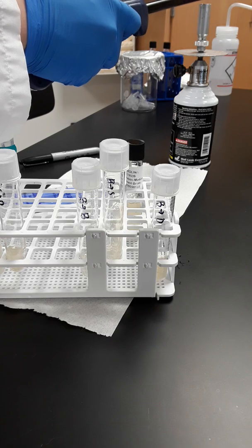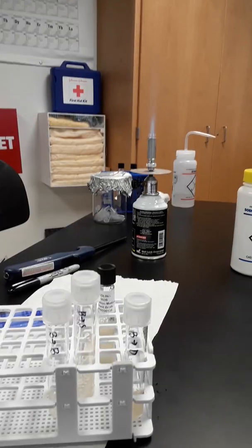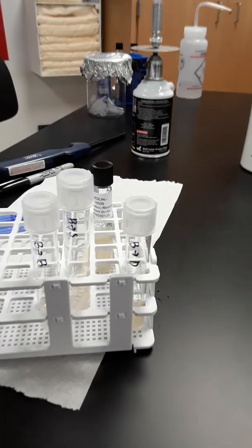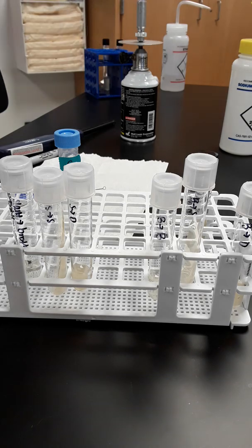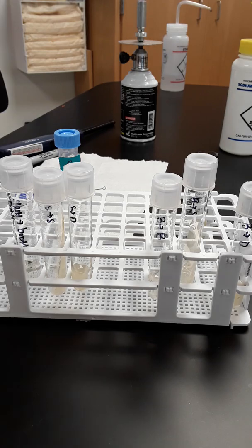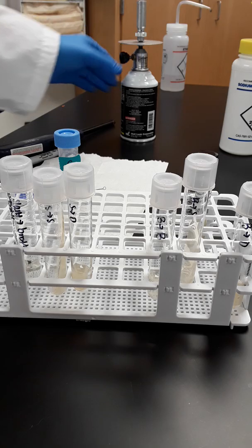So, first thing for sterile technique is we're lighting the flame, and we're going to make sure that it is blue. Blue is the hottest. Blue is going to be the way that we transfer this. So let's clear some of this material out of the way that we don't need. Okay, you can also turn this down just a little bit, it goes a long way.